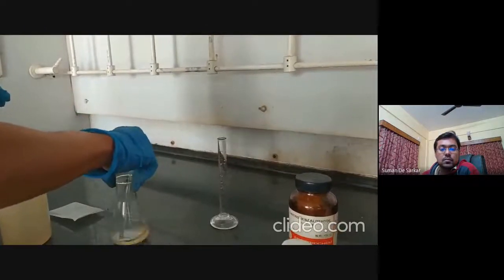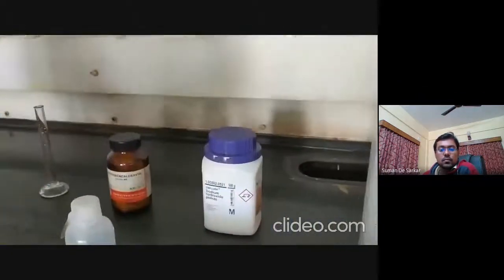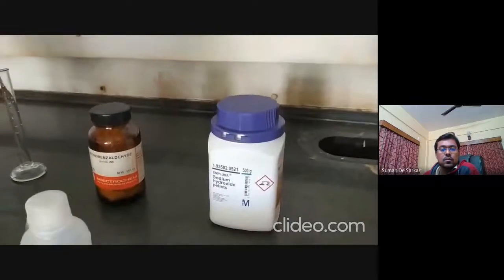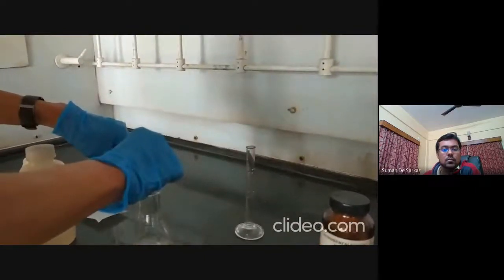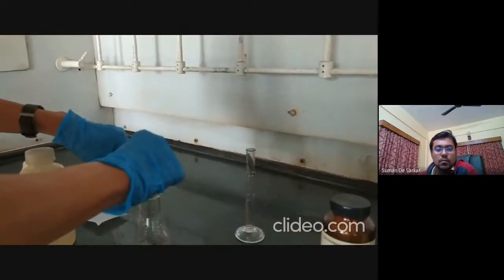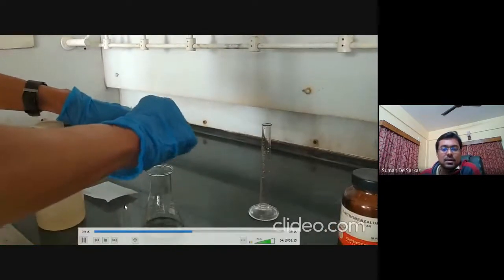And now we will add sodium hydroxide, 1 normal solution. So we have sodium hydroxide pellets, and we have dissolved the sodium hydroxide pellets to prepare 1 normal sodium hydroxide solution. So we are adding 2.5 ml. Oh, you see, the color is already appearing.